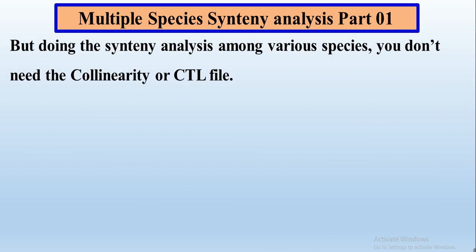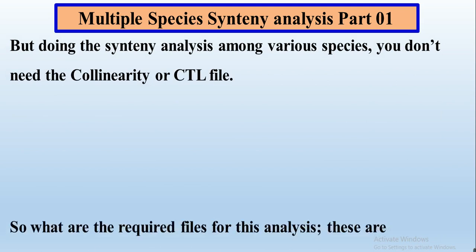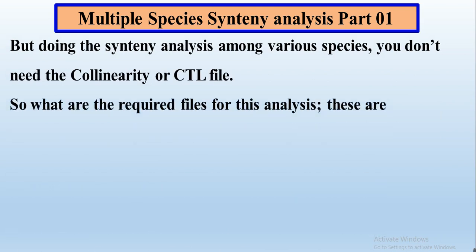But when doing synteny analysis among more than two species, you don't need the collinearity or CTL file, so in this way you will skip this big problem. So what are the requirements or required files for this analysis?